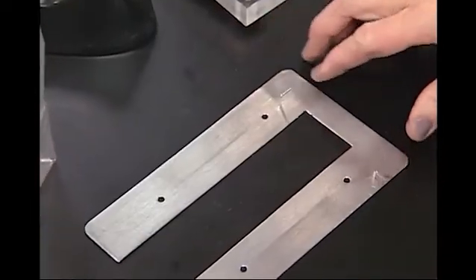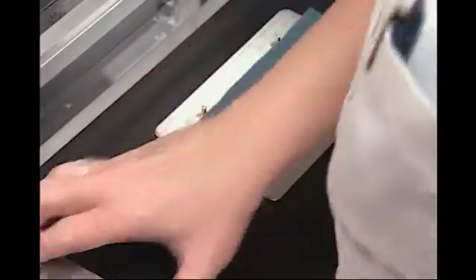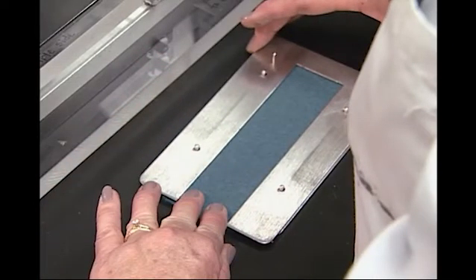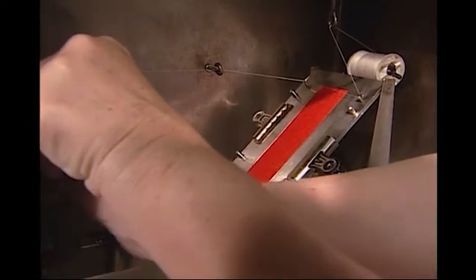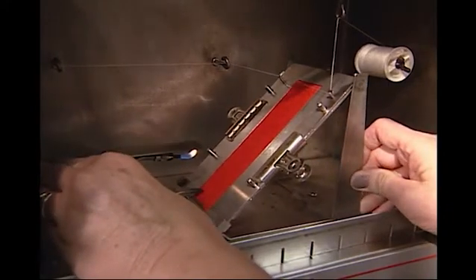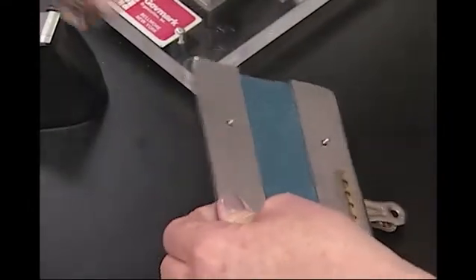The specimen holder consists of a top and bottom U-shaped metal frame. The top piece of the holder has hooks or thread guides on it for positioning the stop thread. The stop thread will have a weight attached to it. When the thread is burned, the weight drops to stop the timing mechanism of the test apparatus. The upper and lower portions of the specimen are secured in place between the two pieces of the metal frame with clips.